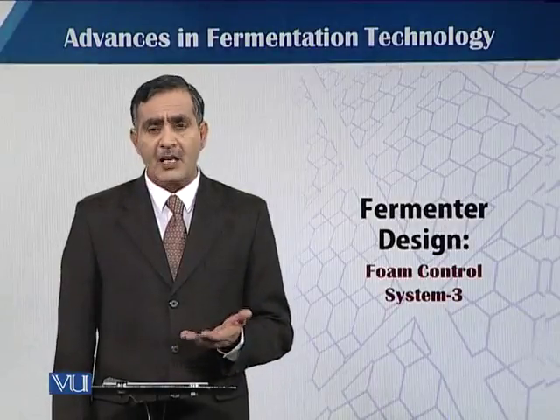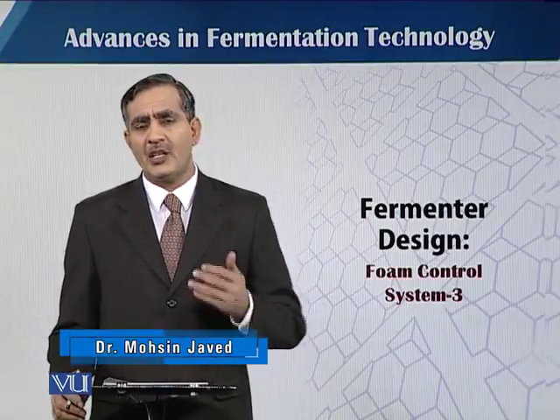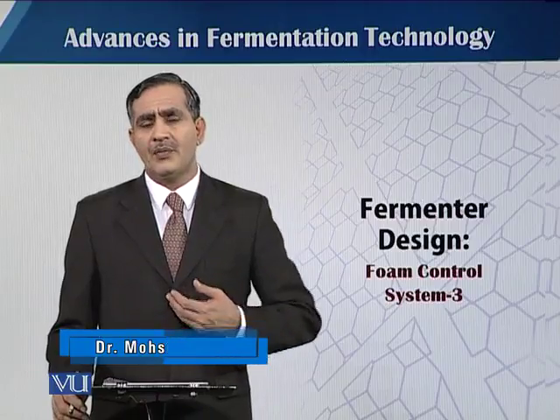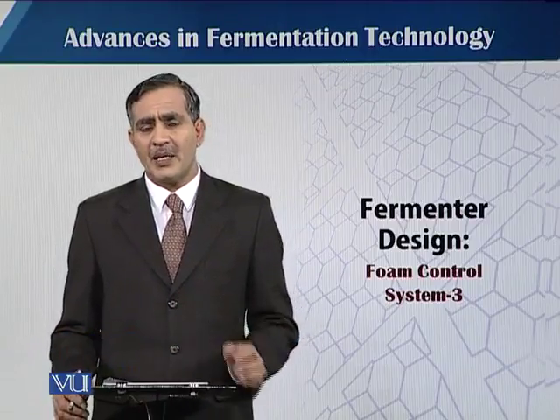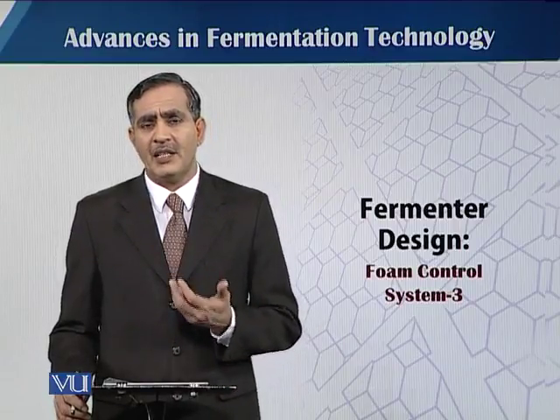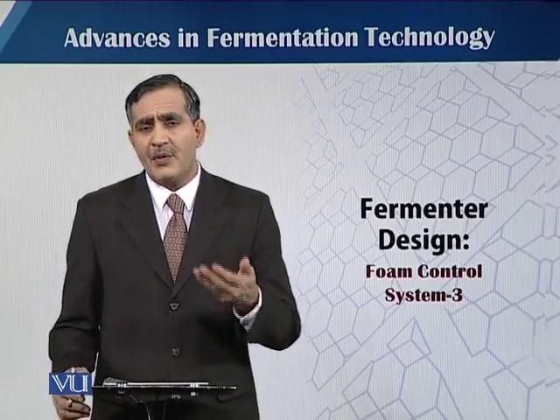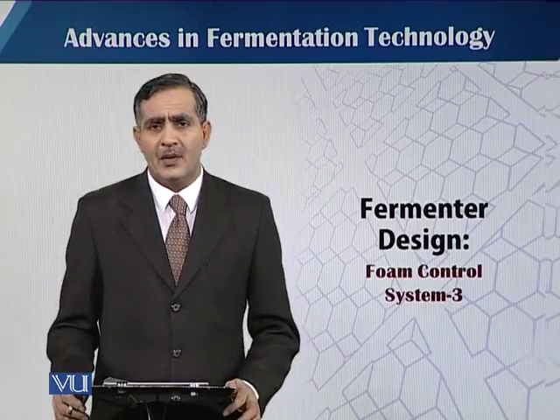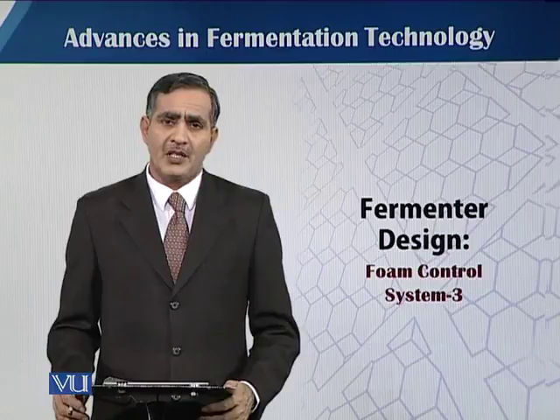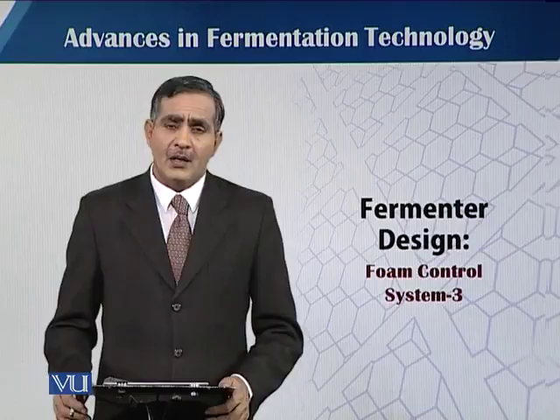In this module, we'll talk about how we can control the addition of the anti-foaming agent when we use foam control by chemical methods, by using some chemicals having an anti-foam or defoaming effect. There are two choices. When there is foam, we add it manually, or we have an automatic foam control system. The modern fermenters have automatic systems.